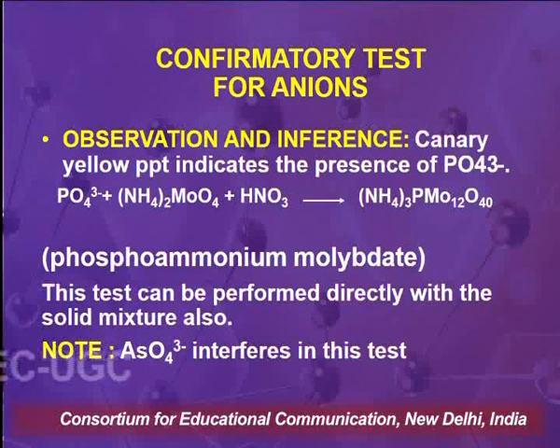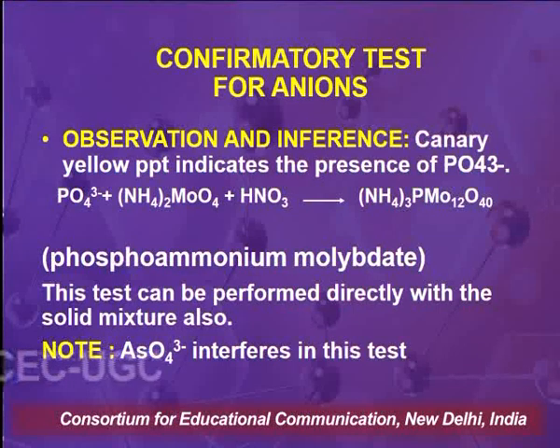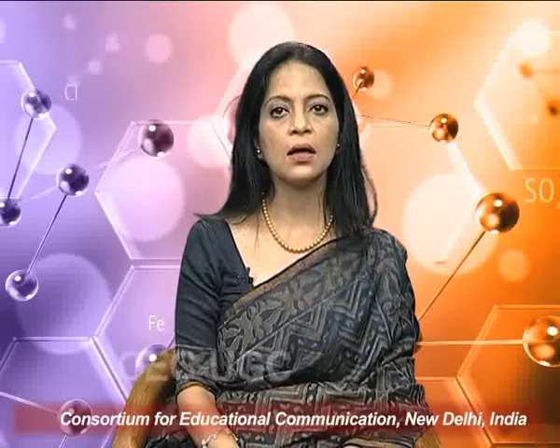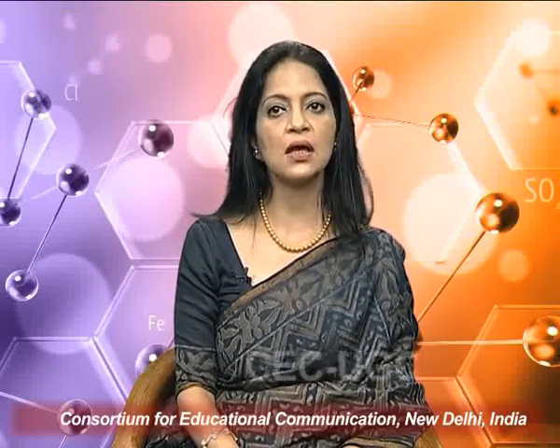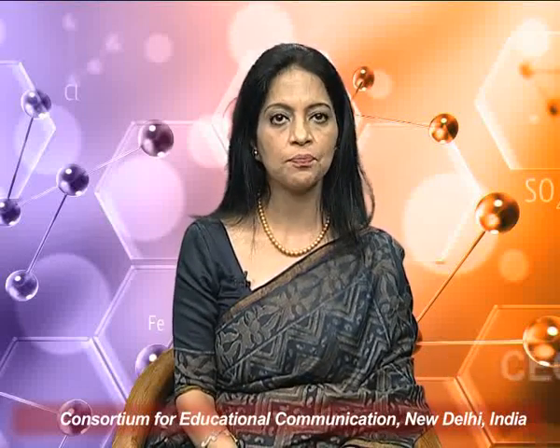This test can be performed directly with the solid mixture also, and arsenate ions interfere in this test. That means they give a similar kind of canary yellow precipitate of ammonium arsenomolybdate. So, to distinguish between arsenate and phosphate, separate tests are there which we will discuss later.